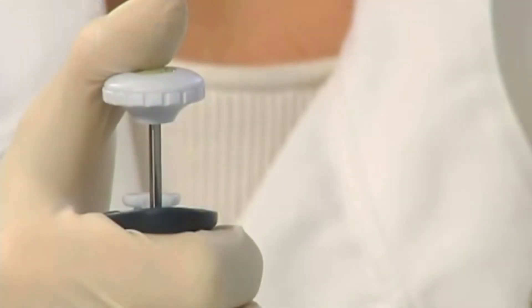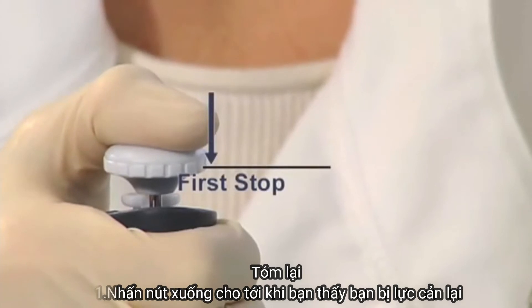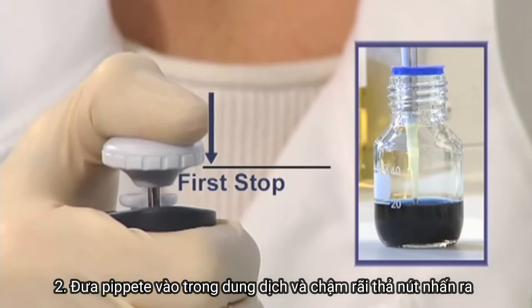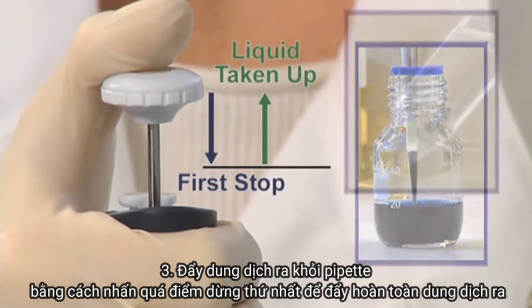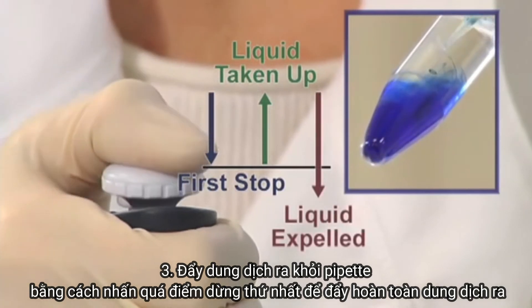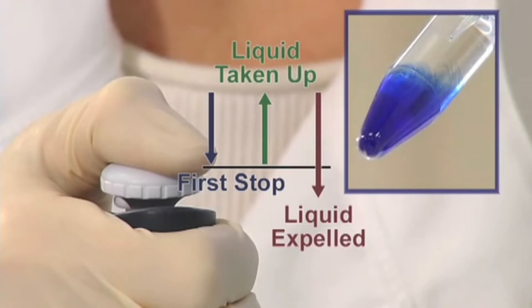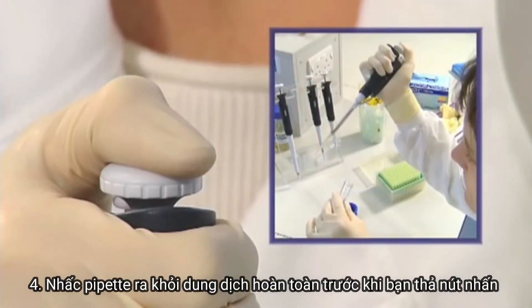To recap: push down the push button until you feel some resistance, place the pipette into the liquid and slowly release the push button. Release the liquid from the pipette by pushing past the first stop to fully expel the liquid from the pipette tip into the recipient container. Withdraw the pipette from the container before you release the button.